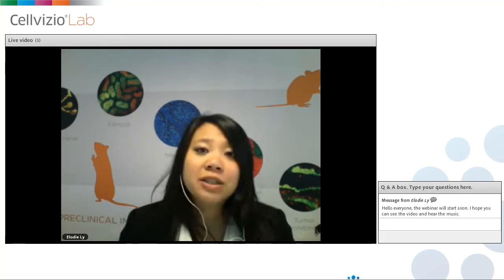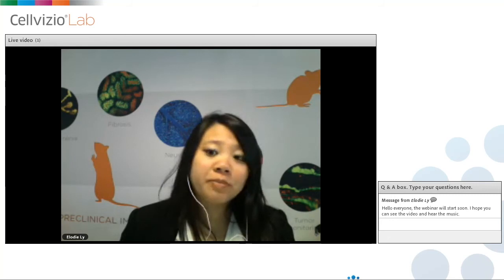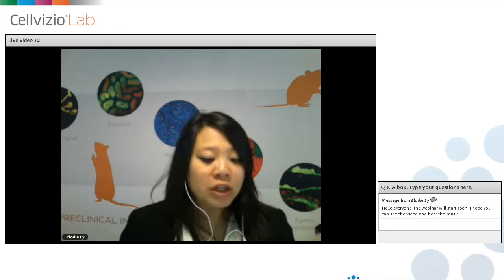Another possibility is to use Evans blue. Evans blue will work with the 660 nanometer laser, so you will see that on the red channel. And Evans blue binds to albumin. There are other commercial dyes that you could use to look at vasculature, such as AngioSense or AngioSpark, for example.